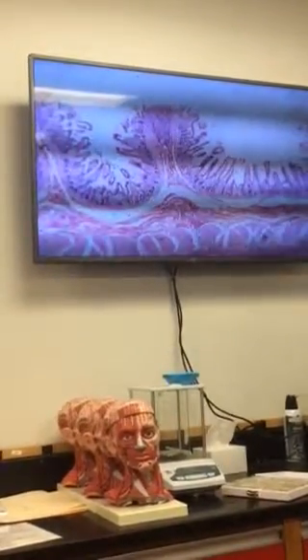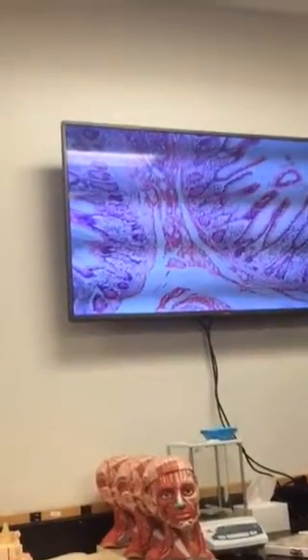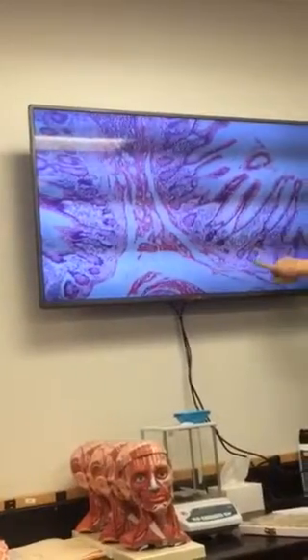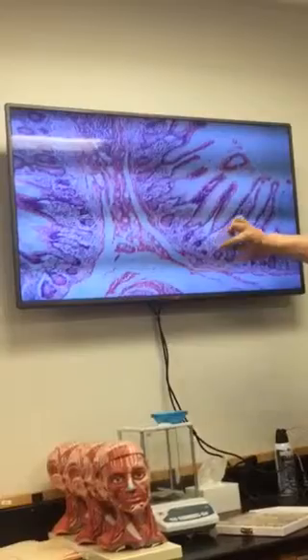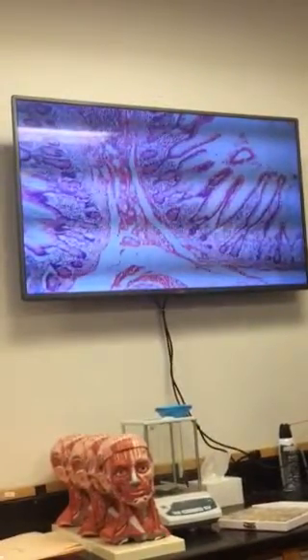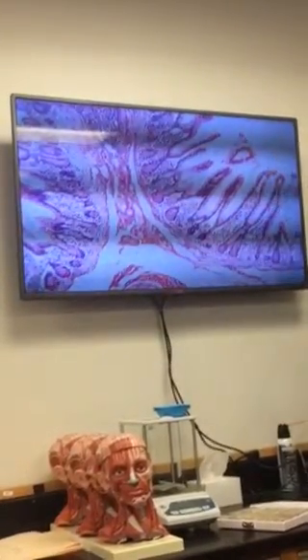And then if you look at, yep, there it is. If you look at one villus, you see that big cavity there going up inside the villus? That's your lacteal. That would be probably a lacteal. So sometimes you can see a longer length, but that would definitely probably be a lacteal. And then there's a network of little blood capillaries that kind of encase that lacteal.